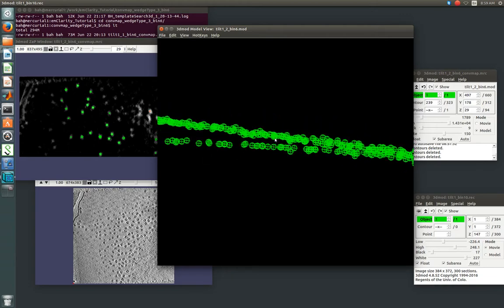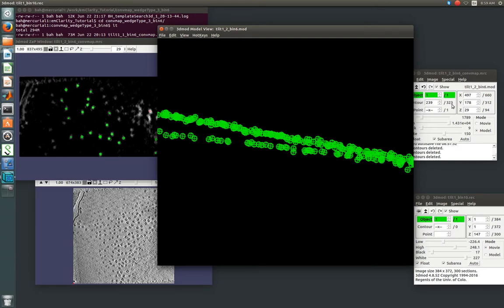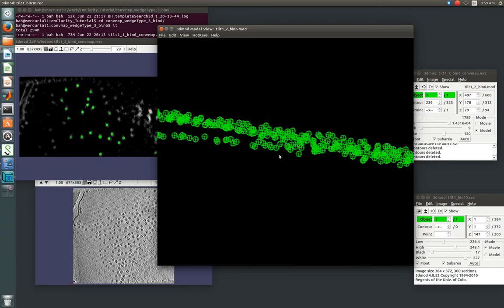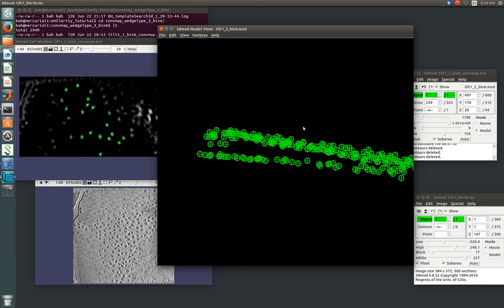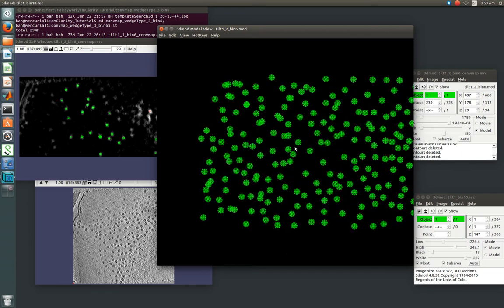So, we've gotten rid of most of those junk hits very quickly. You see we've already deleted 80 contours. So, it's much faster than selecting it point by point.